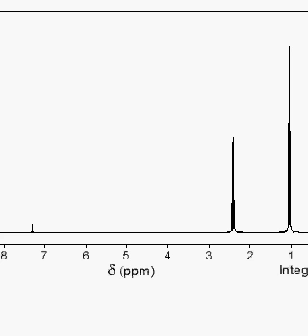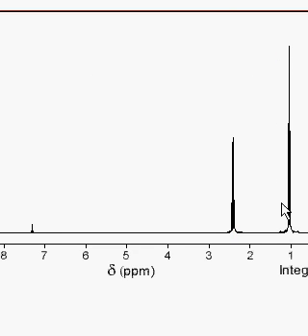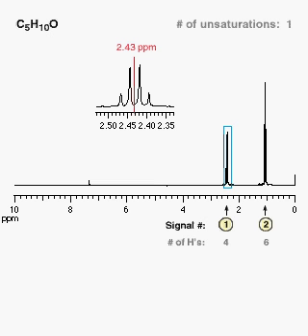In expansion mode, clicking on a point in the spectrum will enlarge a region 0.2 parts per million wide. In the expanded area, use the cursor to measure frequencies by clicking on the peaks and noting their respective values in parts per million. The chemical shift of a multiplet is the frequency at its center.